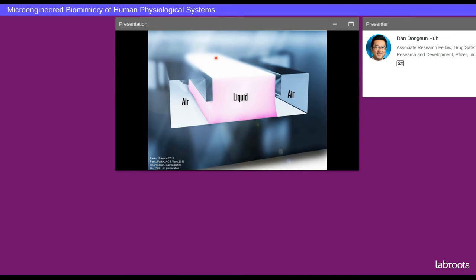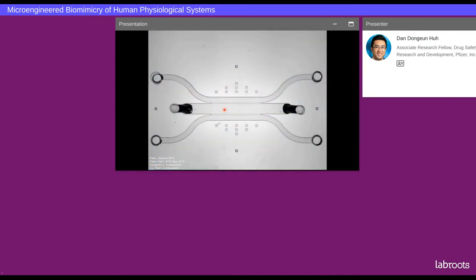Liquid is injected into this middle lane. It nicely follows the lane. It never spills over to the side lanes because it gets pinned along these barriers due to surface tension. This capillary pinning effect is demonstrated in this movie, where black fluid coloring is injected into the central channel. There's a little bit of bulging, but it never spills over to the side lanes.